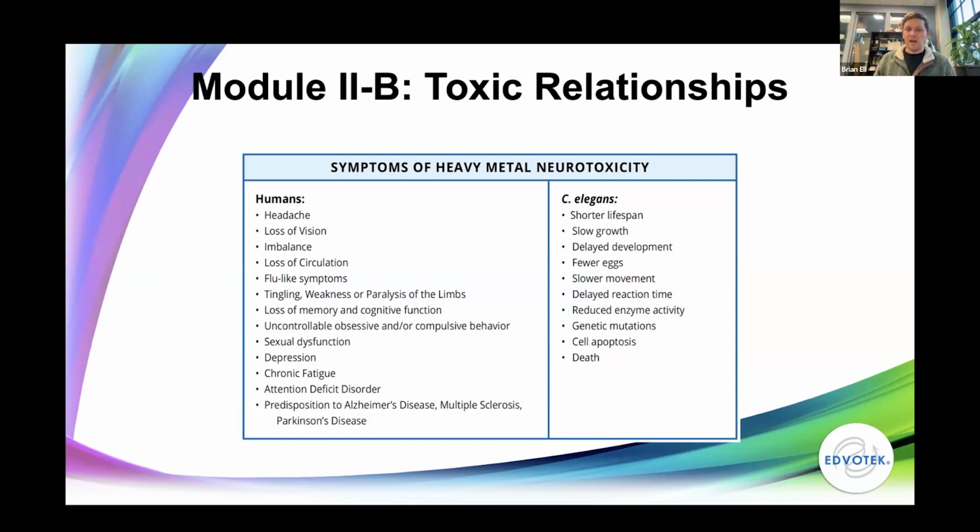Now, the amount of heavy metals that we are providing in the kit is actually incredibly low. So there's no safety risks for the students, but since we're putting them directly onto the C. elegans, it kind of magnifies this effect. We're essentially bathing them in these heavy metals, and they're able to absorb really rapidly into the worms the way that we're doing this culture.